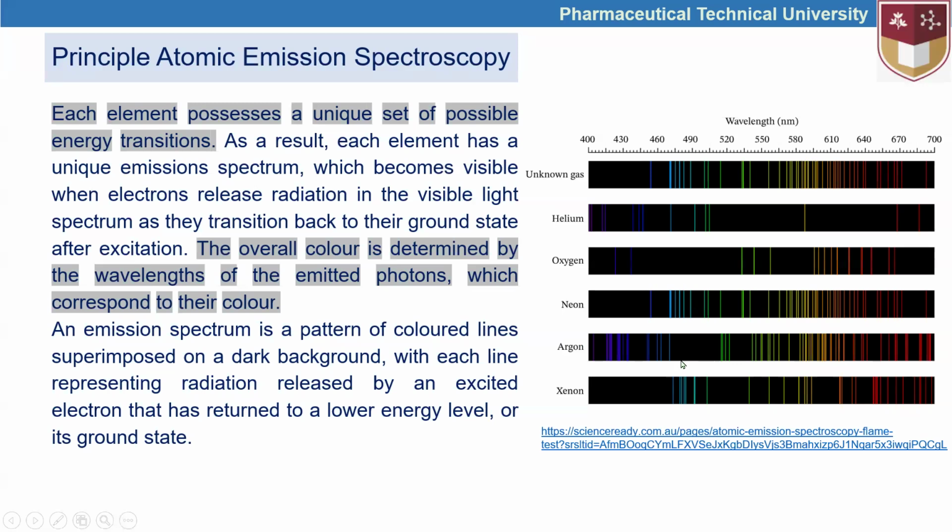Here we can see some close bands to each other because they have atoms in similar shells, but we also observe quite many differences.